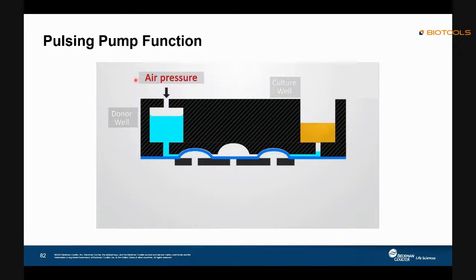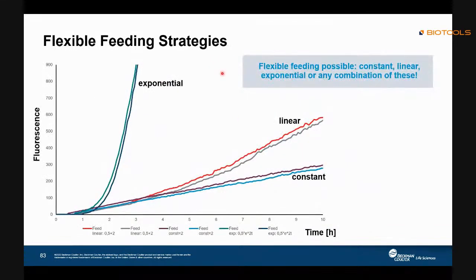And we can control the amount going in from the reservoir. We can do it by exponential, a linear adding rate, or a constant rate. Not only these three methods, we can also do some kind of combination of the three feeding modes.